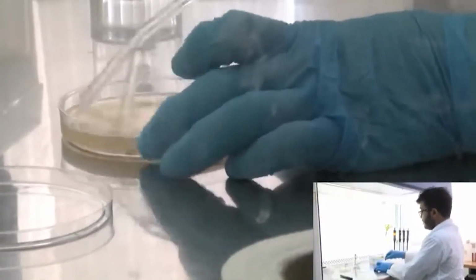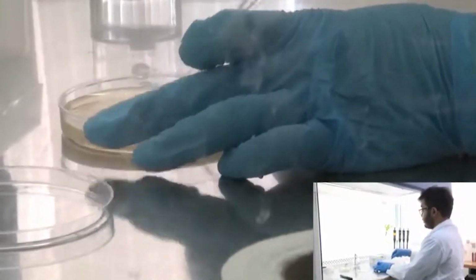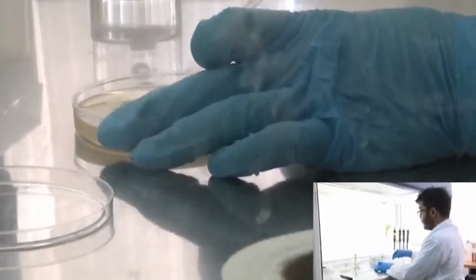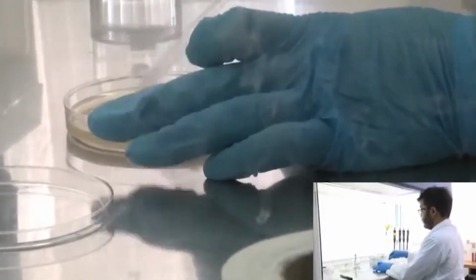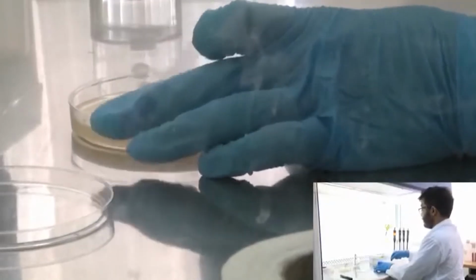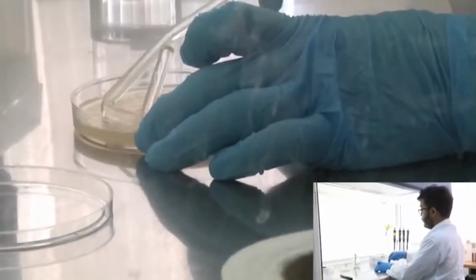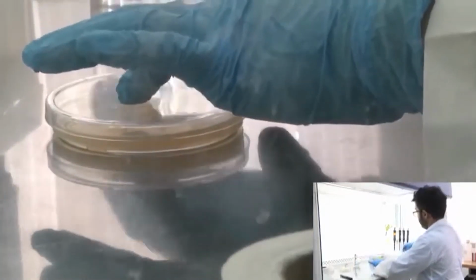You cannot see this, but since I added only 20 microliters compared to the earlier plate where there was 200 microliters, it doesn't take too long. I can already feel that the slipperiness because of the liquid is going away. Since it's getting properly spread, it's becoming stickier and drier already, which means that the spreading is actually complete. So yeah, spreading is complete. I'm going to stop here. I'm going to put on the lid and keep this for incubation.